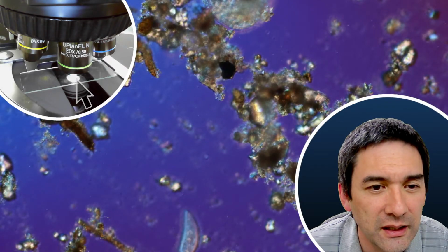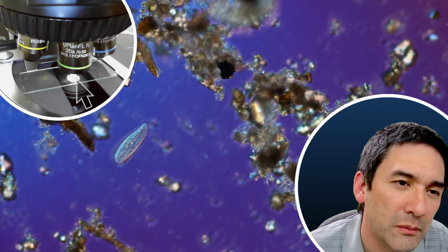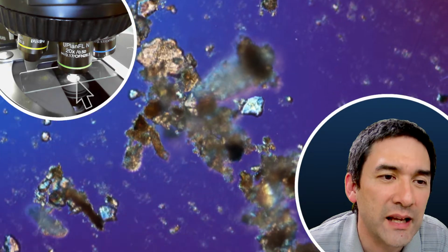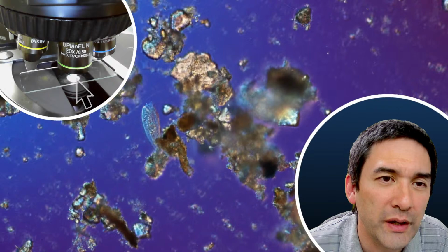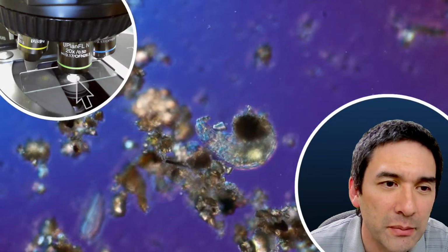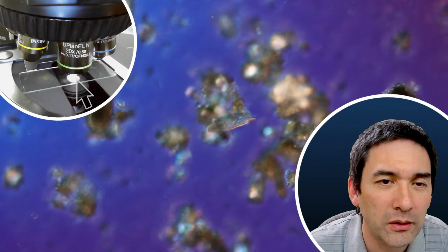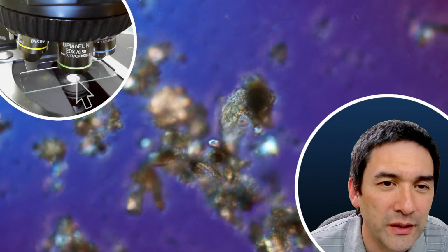Here, that's a ciliate again. I don't know, it looks a little bit like, no, it's not paramecium, but here, the single-celled protist. It kind of also shows you a little bit the size relationship: this protist down here is made of one cell, and the tardigrade, just a bit larger, right next to each other right now, is made of maybe around 1,000 cells. So it's quite remarkable how cell size can be different. Let's see now the protist and the tardigrade next to each other.